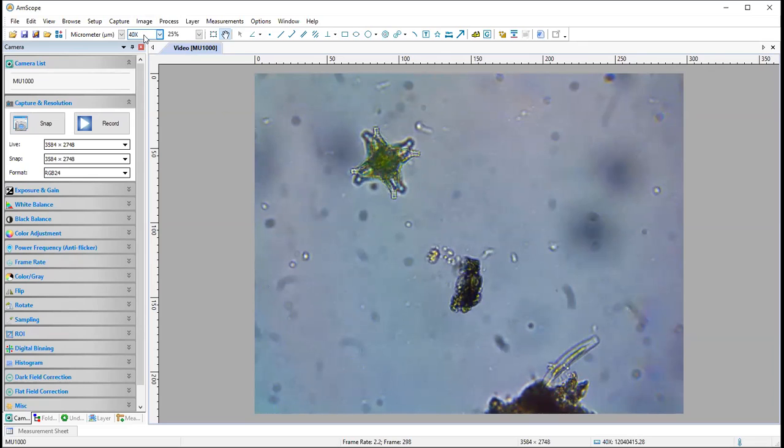So let's say that I found focus. So it's a three-dimensional object, so the bottom is blurry, but the top half is in focus. So you're not going to be able to get everything in focus. And the thing is, you'll probably need to take multiple pictures per specimen. I'll, again, explain that separately, but for now, just the simple mechanics. I'm seeing what I want to be seeing.